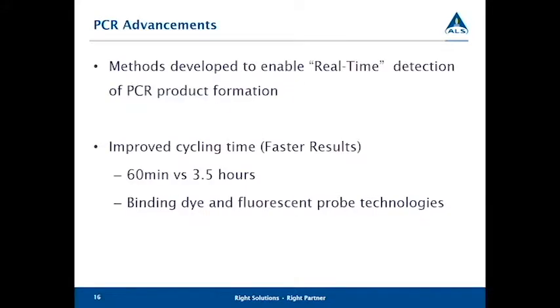So as with all technologies, there's advancements. And the incorporation of the fluorescent dye into the reaction makes the detection process easier in real time. Now there's several dyes and many different ways to use them to detect the target amplicon, all with varying degrees of sensitivity and specificity.